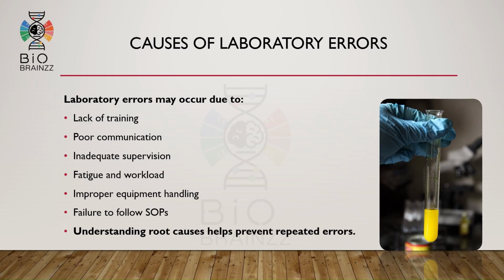Laboratory errors may occur due to several reasons. Lack of training, poor communication, inadequate supervision, excessive workload, improper equipment handling, and failure to follow SOPs are major causes of errors. Understanding the root causes helps laboratories to prevent repeated mistakes.